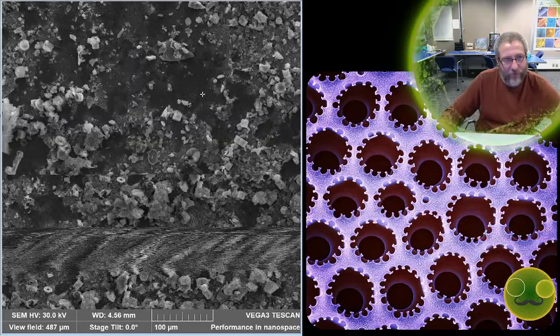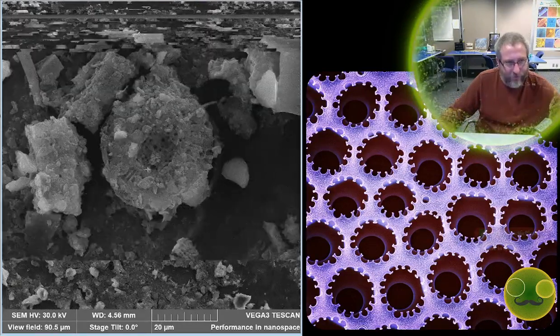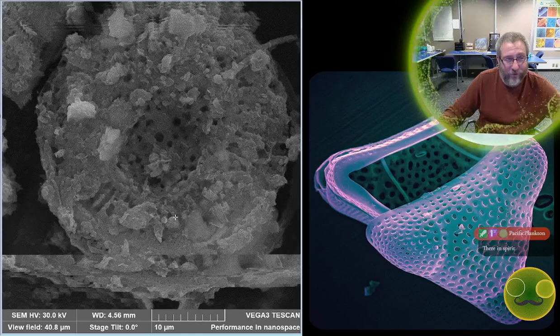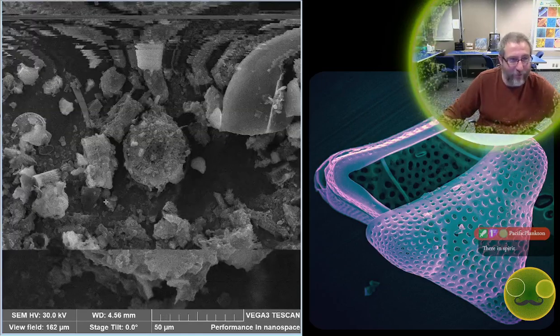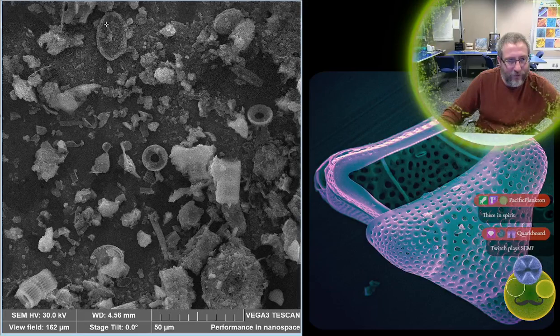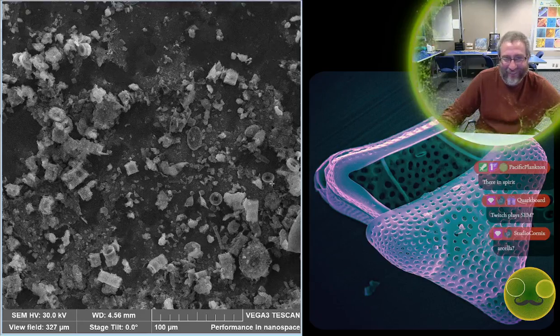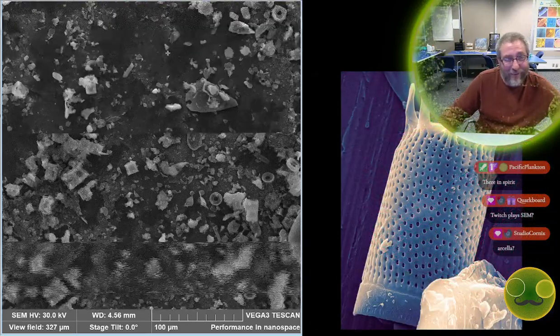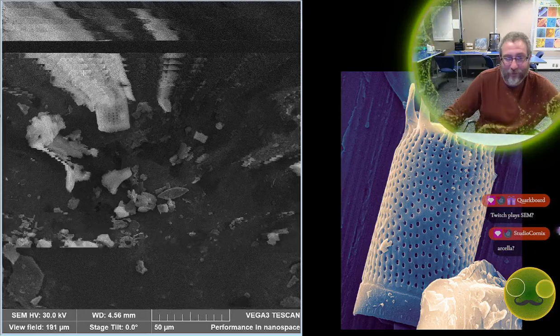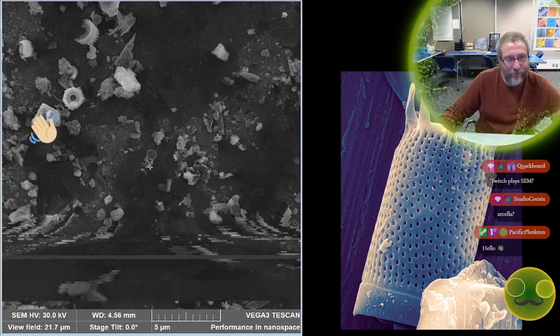This is a giant something right here. What is this? We never know what we might find. In fact, most of the stuff that we're looking at probably doesn't have names, by the way. Here's another one of those cyclotelloids. That's a Cocconeis. I mean, they have genera, like they belong to a genus. Some of them don't belong to any genera either, because they're ancient, and people haven't necessarily looked closely for what these things are. And probably not very many people have looked at them in the scanning electron microscope, except for my dedicated Twitch followers. Probably have seen some of the stuff before.